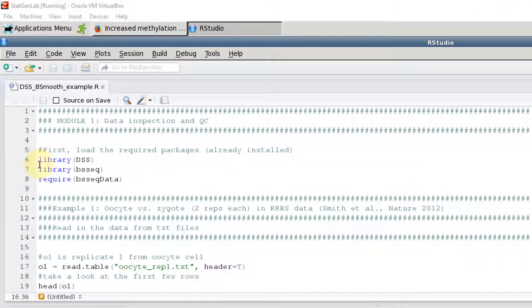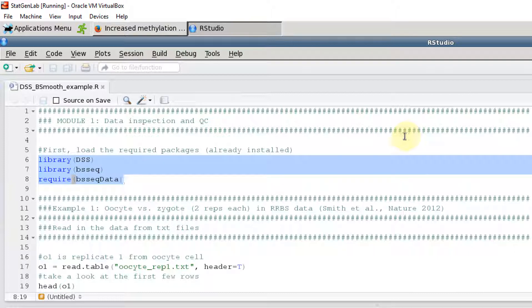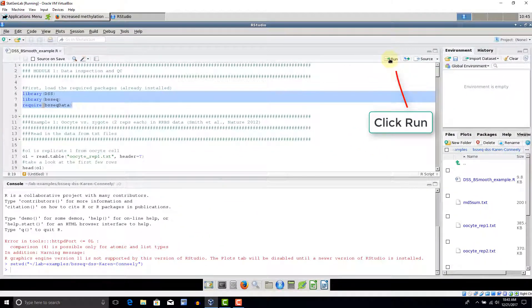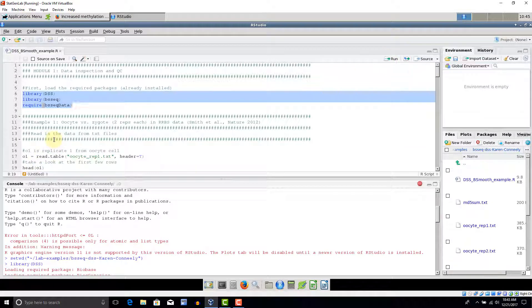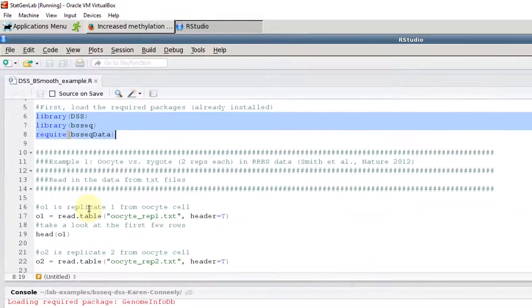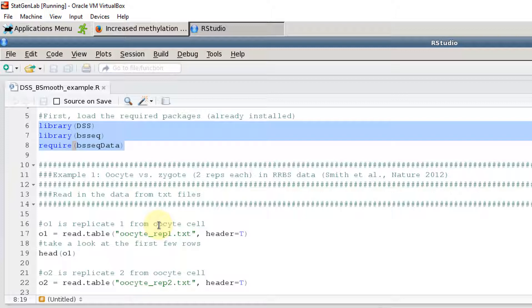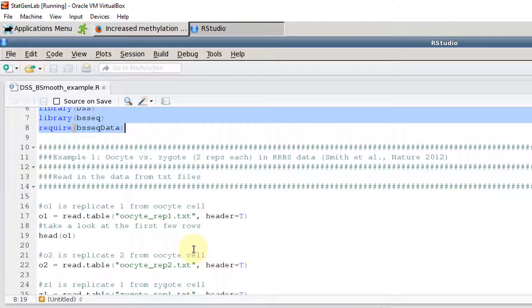Our first step will be to load the required packages, which we've already installed. We've got DSS, BSseq, and then we have an example dataset from the BSseq package called BSseq data, which will be used in the third module. I'll run these three library commands to pull in the two required packages and the data. We'll then begin our first example, which is analysis of two replicates each of mouse oocyte and mouse zygote — reduced representation data from a Nature publication from 2012 by Smith et al.